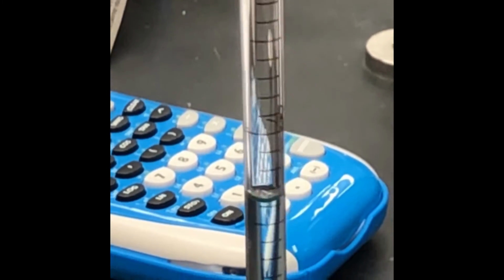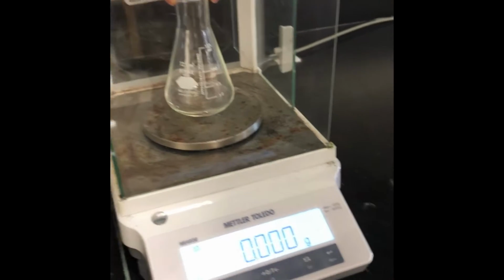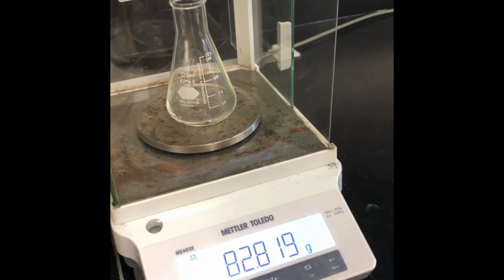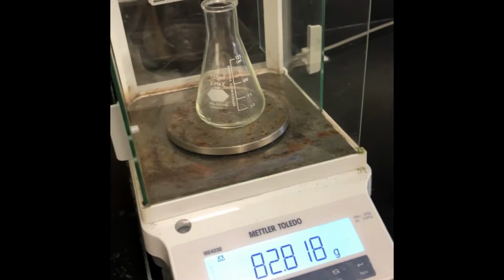For challenge 1, the 125 milliliter flask must first be placed on the balance, so we can use this mass to determine the mass of the water placed in it. The mass of the flask is 82.81 grams, which does not need to be measured to a degree of uncertainty because the mass gives an exact measurement.